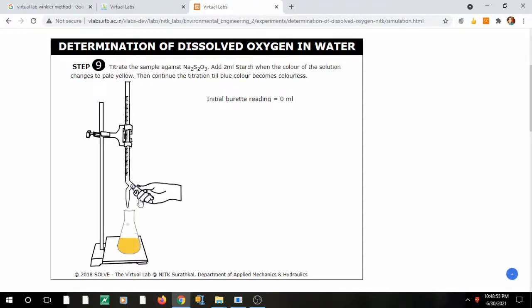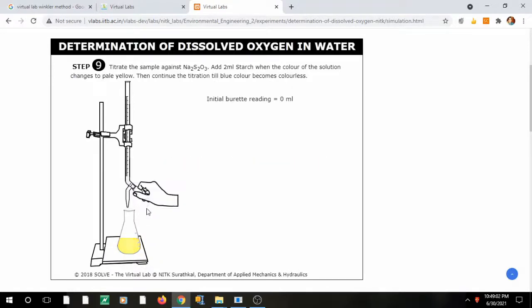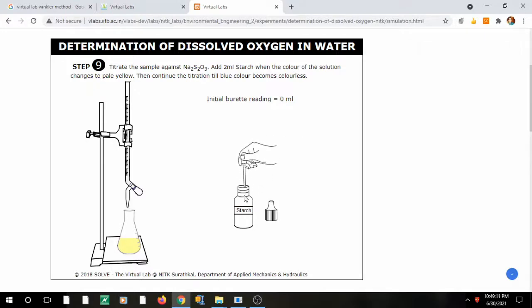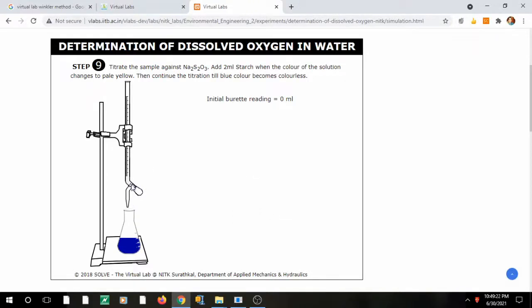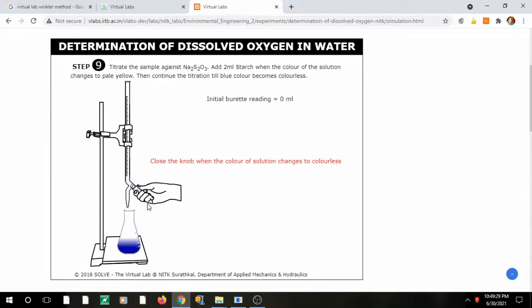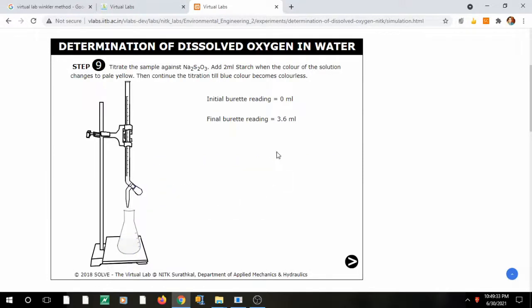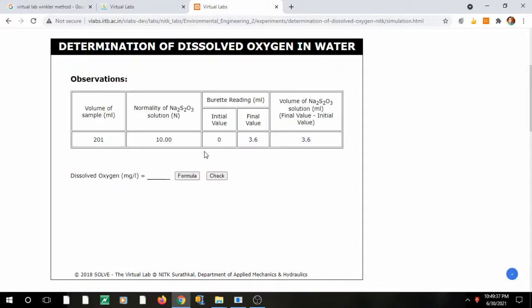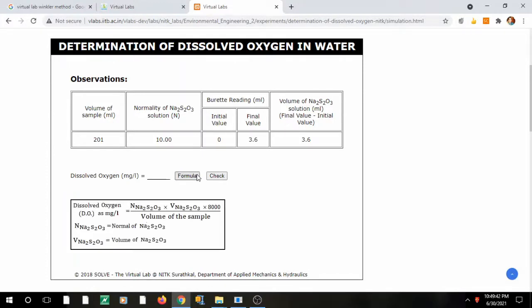Fill the burette again with sodium thiosulfate. The remaining steps are the same as before. The only difference is that this water sample has dissolved oxygen — the more oxygen dissolved, the more Mn²⁺ will have been converted to Mn⁴⁺, the more iodine will be liberated, and the more sodium thiosulfate will be needed to titrate it. Remove the funnel and begin the titration. Stop the knob when the solution is pale yellow.